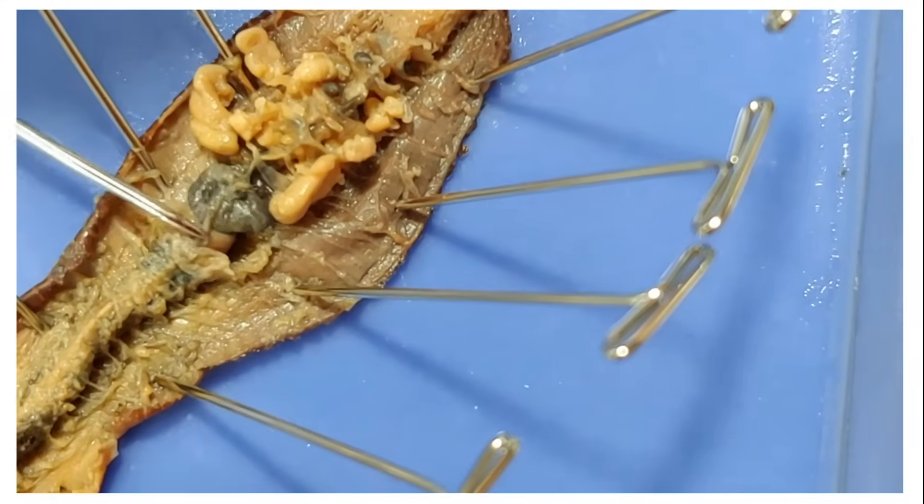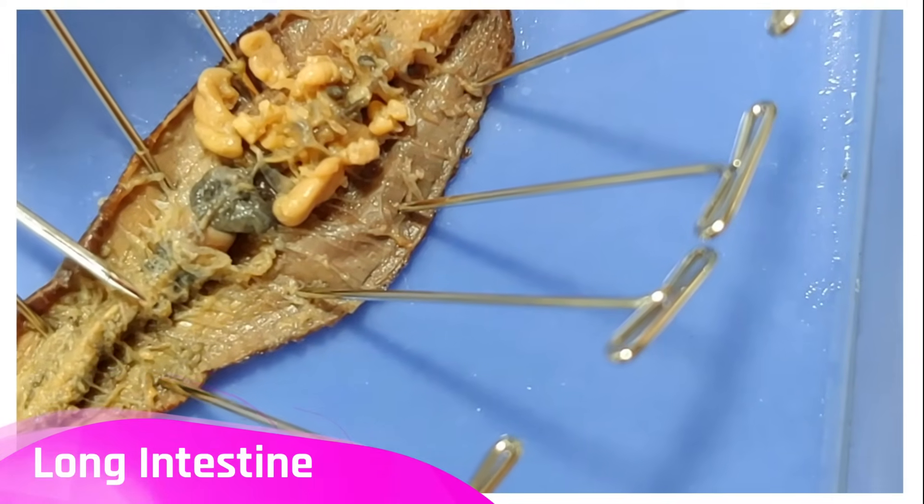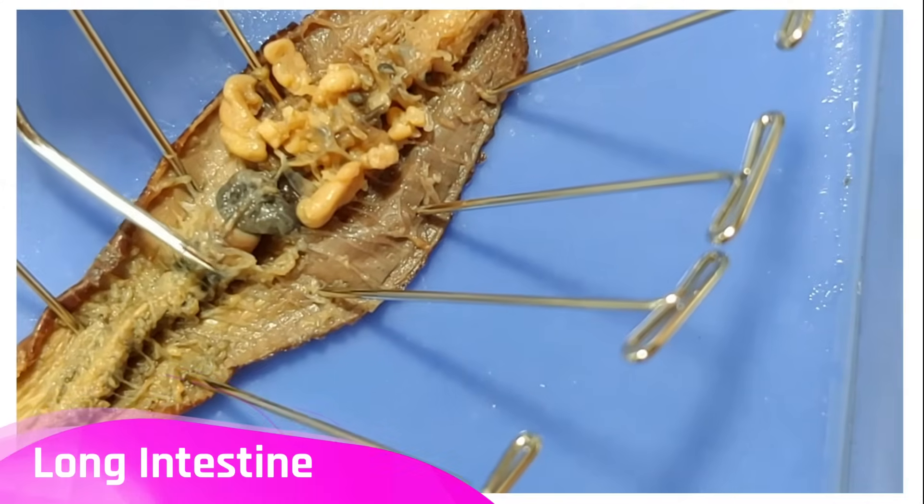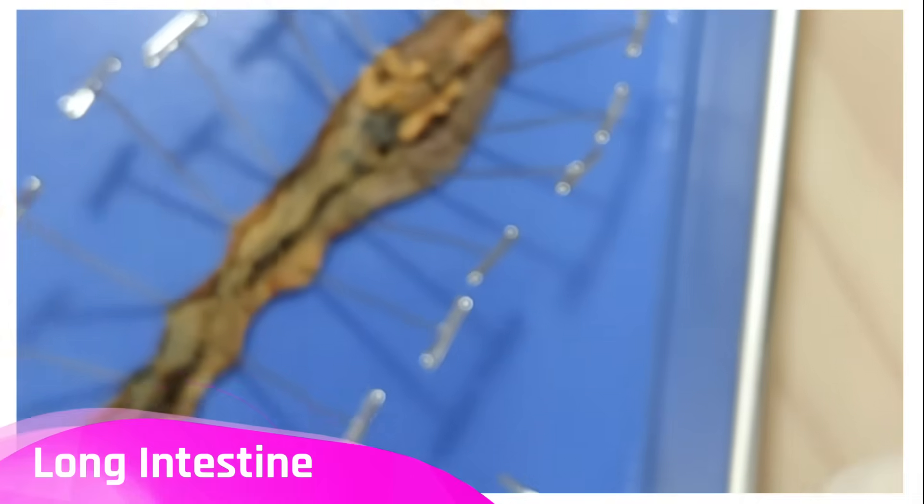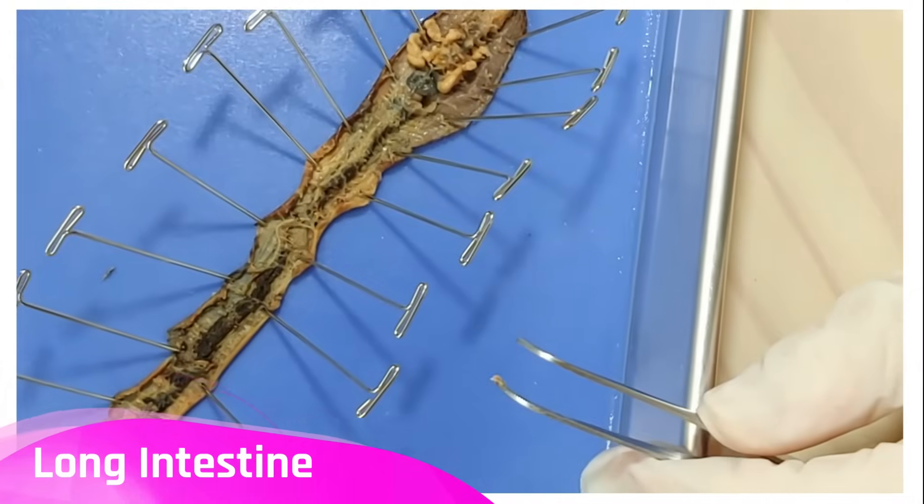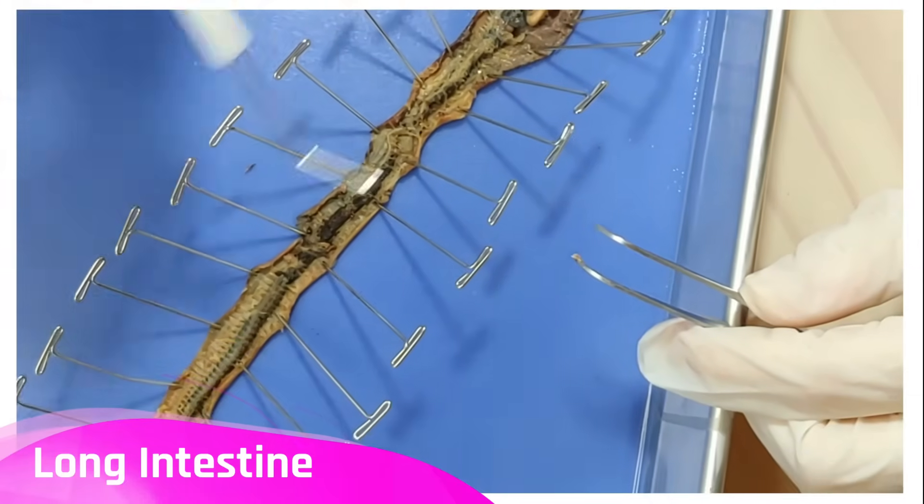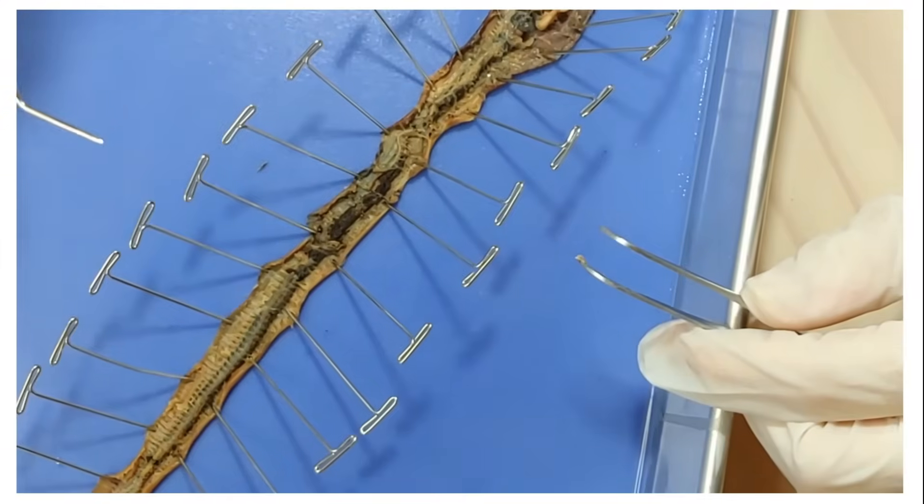Once the food leaves the gizzard, it enters this long intestine. The intestine is where the nutrients from the food are absorbed and it's really long. Focus. It's really long. There we go. So that more nutrients can be absorbed before the food gets kicked out.